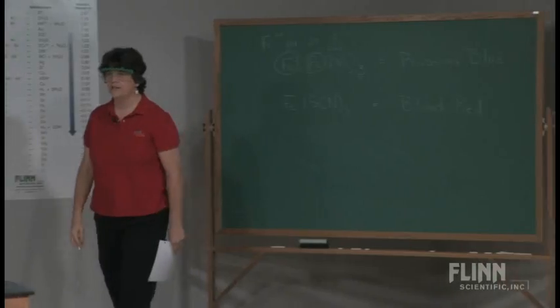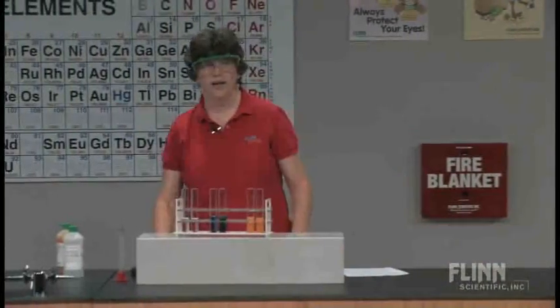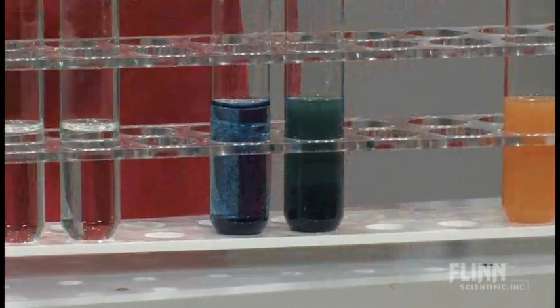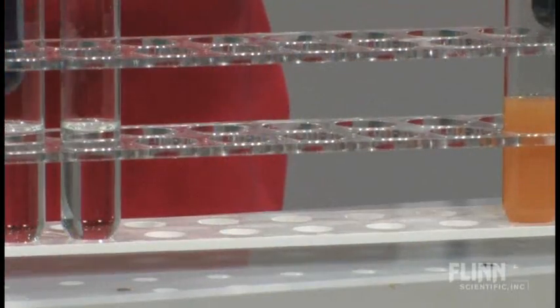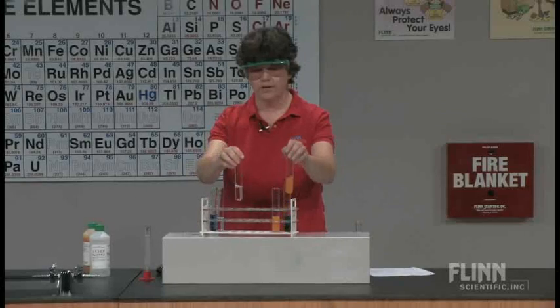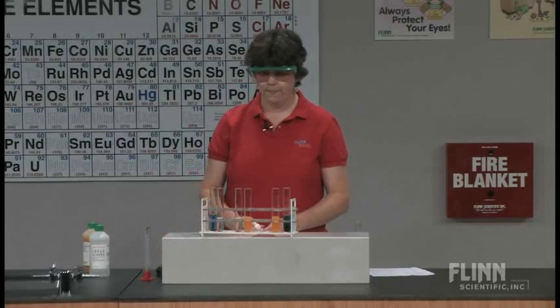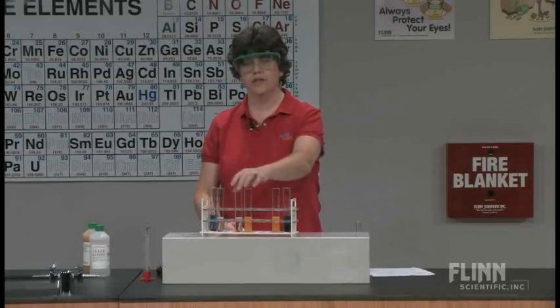So back to our test tubes. The Prussian blue color that we're getting is when we have both ions mixed together in the solution. So let's see what else we can do with this. I'm going to take two more test tubes with my iron two and my iron three. The iron two, which is the colorless, I'm going to add now potassium ferricyanide.